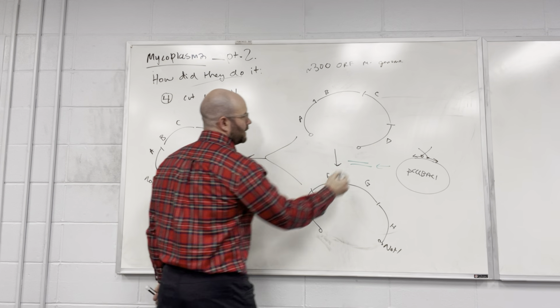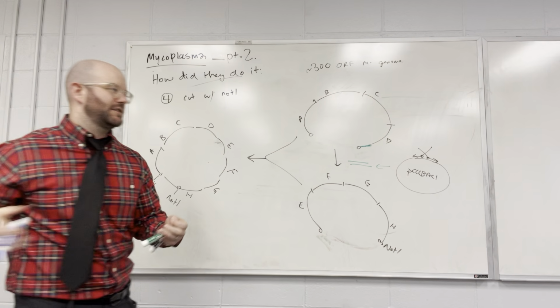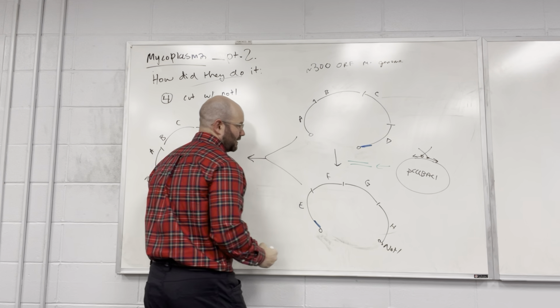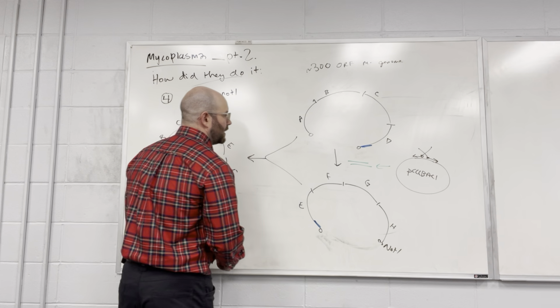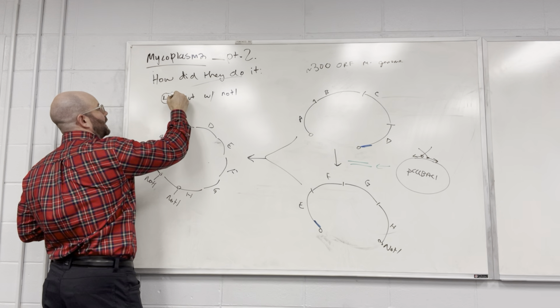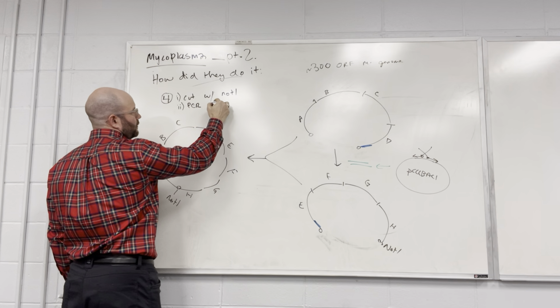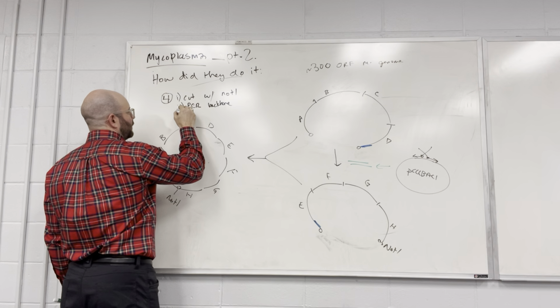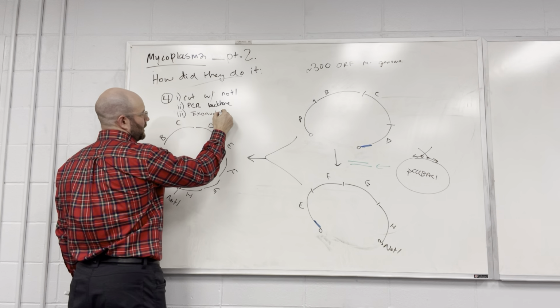They PCR that. And when they built this, I should use a different color now, because now it starts to get really complicated. They built an overlap here that matches here when they built this. So they originally thought this through, okay? And now, if this is for I, double I would be to PCR the backbone with those special primers again, and then they do the exonuclease again.